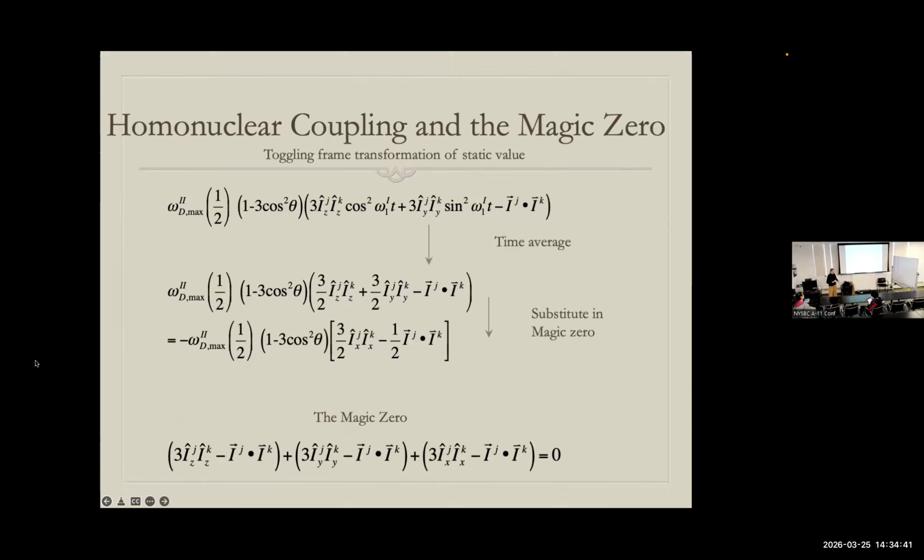So the fact that you have more than one Hamiltonian term, maybe a chemical shift, but definitely another dipole coupling, means you make some moves that are finally unrecoverable in the second half of the rotor cycle. And you don't even need to invoke motion or anything stochastic. It just doesn't completely unwind. It's an old problem in solid state NMR that's intrigued very, very good people. And it's just not a very convergent problem. It doesn't resolve well, other than brute force. Just simplify your spins. Just do it.